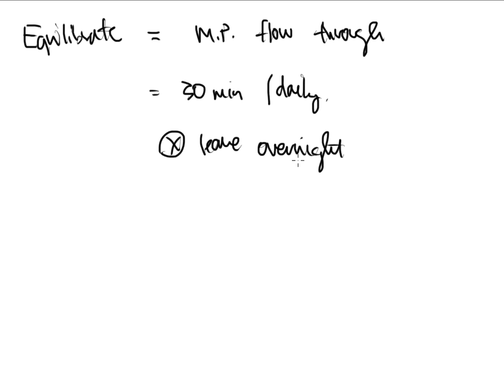So it's just a way that we can saturate the entire instrument with mobile phase. It makes sure that our baseline can flatline, and it makes sure that things are ready to be holding your sample when you begin to inject it. So again, if you run it overnight, no big deal. Just kind of pick up from where you left off and you'll be okay.